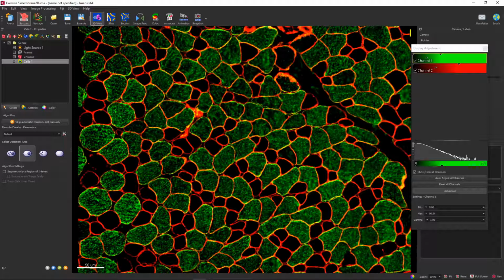For this application, I will use the simplest cell type, and it will be just a membrane without any internal structures. Let's move right away. One small thing, you can always segment just a region of interest. This is very useful when you have a large data set, you are in a hurry, you have a slower machine, so you can always try it on something smaller and see whether it makes sense, and then maybe run the big analysis later.